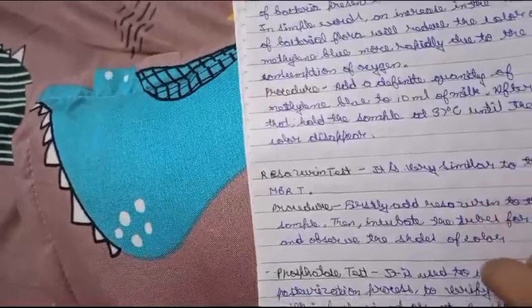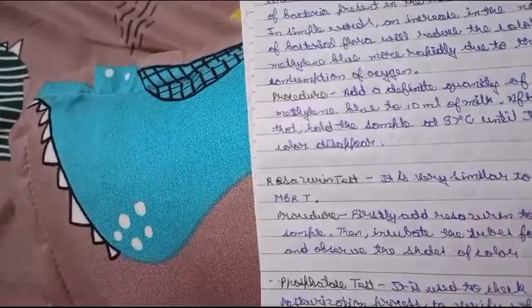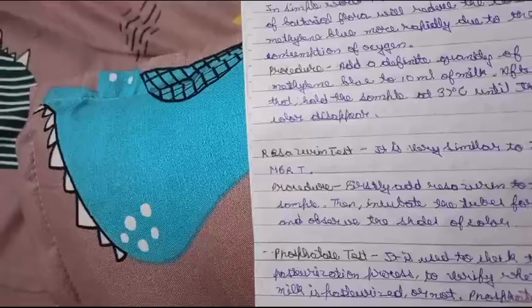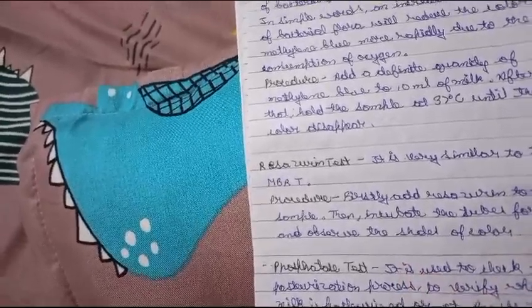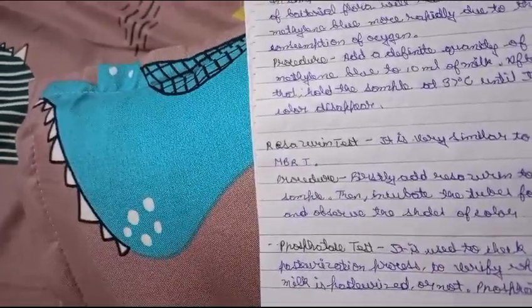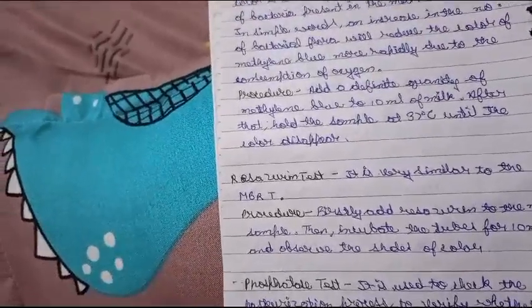Next test is resazurin test. It is very similar to the MBRT test. Procedure: firstly, add the resazurin to the milk sample, then incubate the tubes for 10 minutes and observe the shades of color.